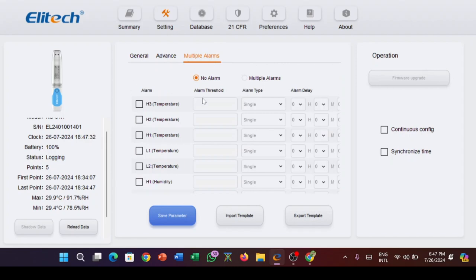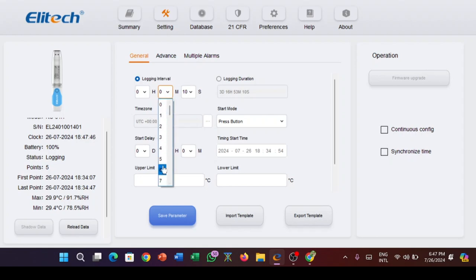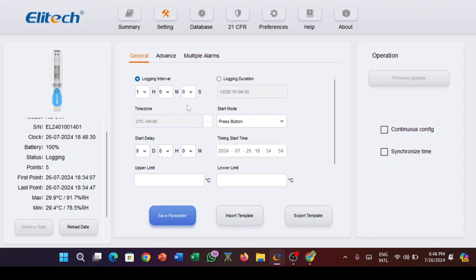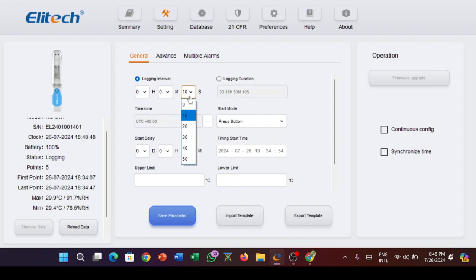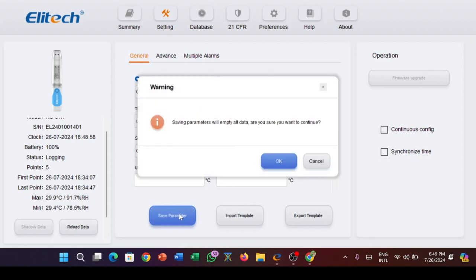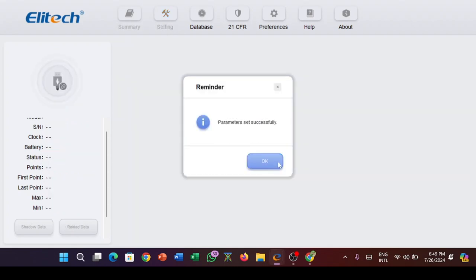To set the logging interval, go to the general menu in settings. Click on logging interval and make your choice. For instance, you can select from the minute or second options. In this case, I set the logging interval to 10 seconds. Save parameter and exit. Voila, you have configured the device.